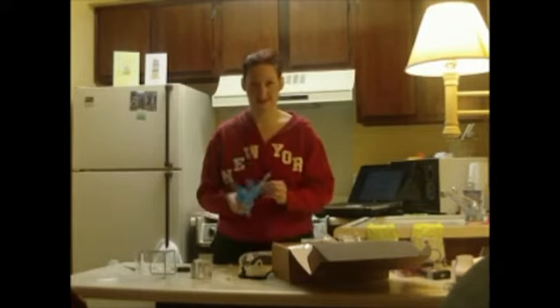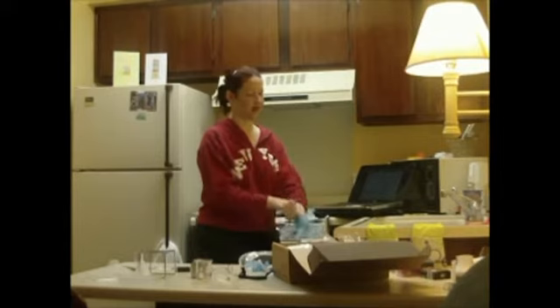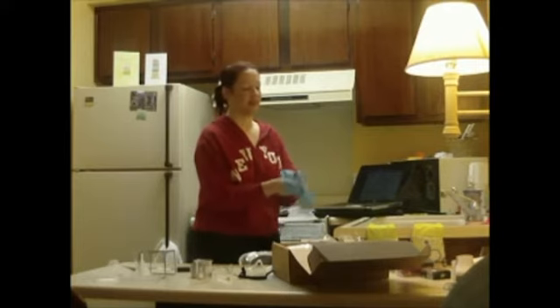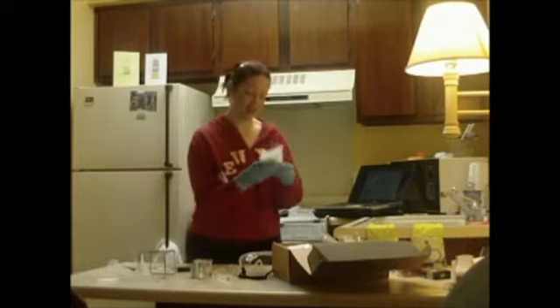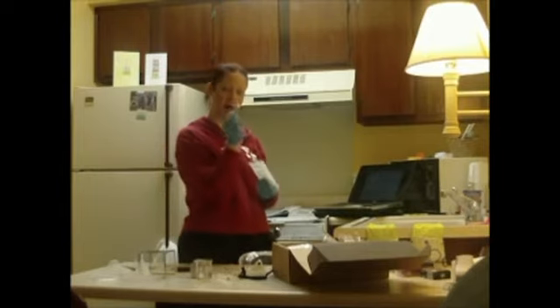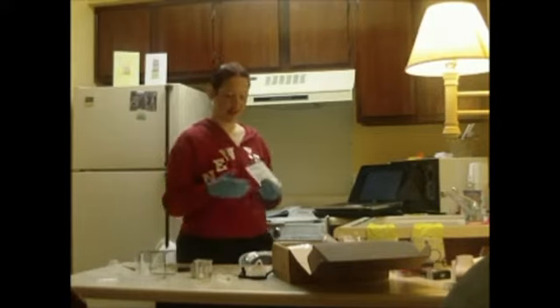We get scared when working with chemicals, so this is when I always start putting on my gloves. I won't even start without the gloves. I need a light to put my supplies on. I know everything is contained, but you can never be too safe. Okay. Here's our copper carbonate tube. Oh, pretty. It's green. I like when a penny turns green.